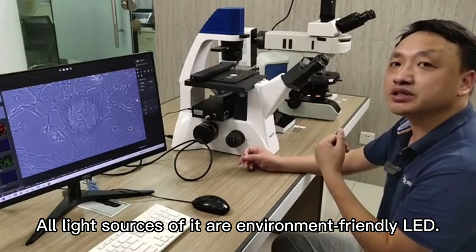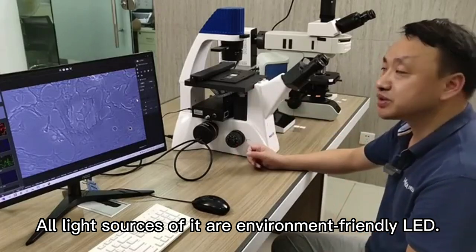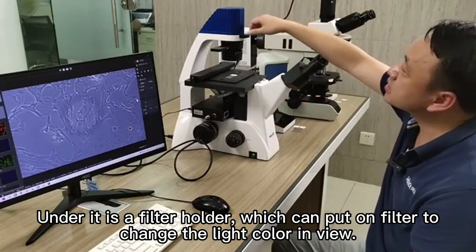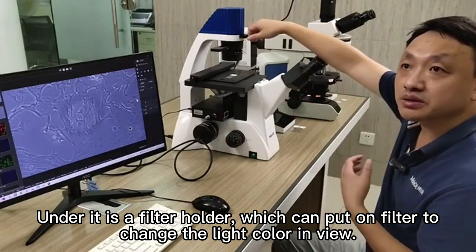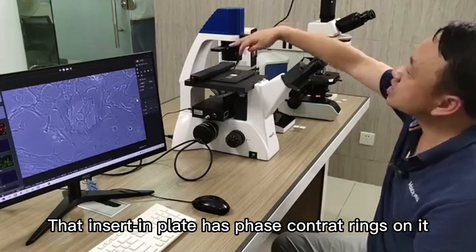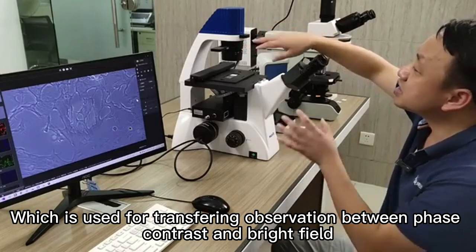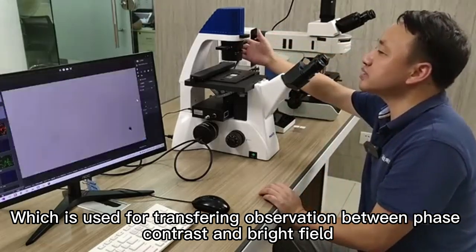All light sources are environment-friendly LED. On the top, there is a LED light source for bright field lighting. Under it is a filter holder, which can hold filters to change the light color in view. That insert-in plate has phase contrast rings on it, which is used for transferring observation between phase contrast and bright field.